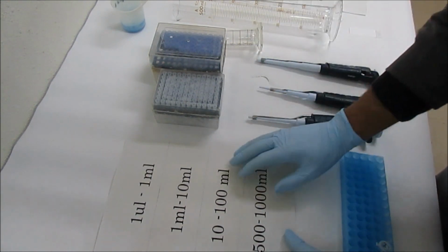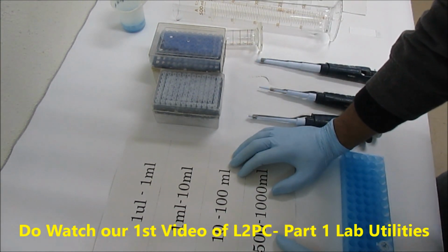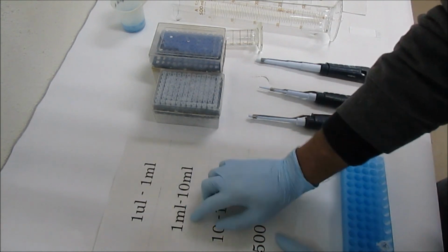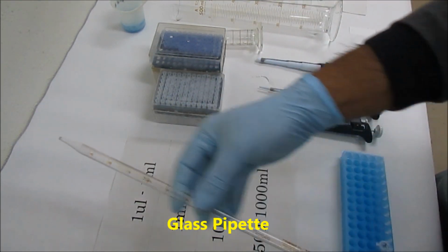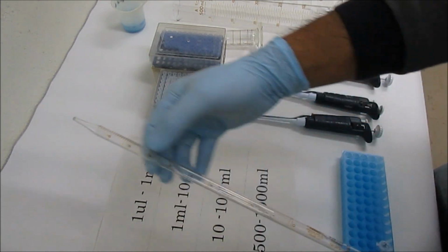You can also see our lab utilities video where we have discussed how to measure liquids with a measuring cylinder. For about 1 ml to 10 ml volumes, we generally use this kind of glass pipette. Here you can see they have markings from 0 to 10.